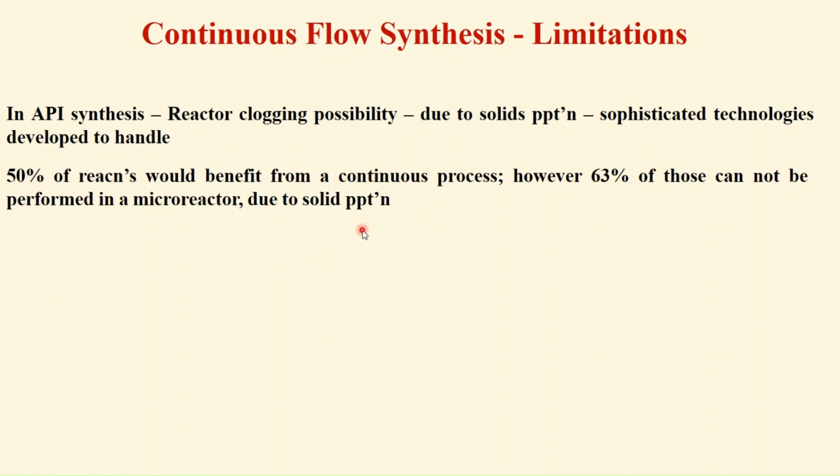That's why we have to use special solvents like N-methyl pyrrolidone, as we have seen in the synthesis of one of the APIs, which is water soluble, water miscible and also organic phase miscible. Still, the problem exists.